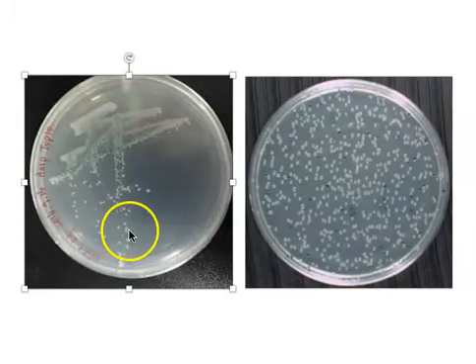Now, when you're making a quadrant streak plate, like the name suggests, you have to divide the agar plate into quarters in your mind. When we're first learning how to do this, we often actually draw lines on the bottom of the plate in order to produce 4 quadrants.